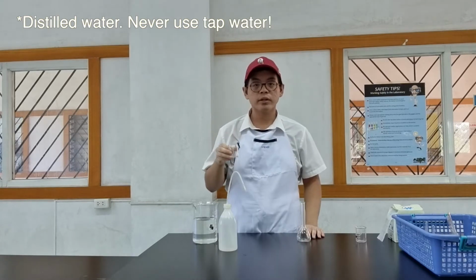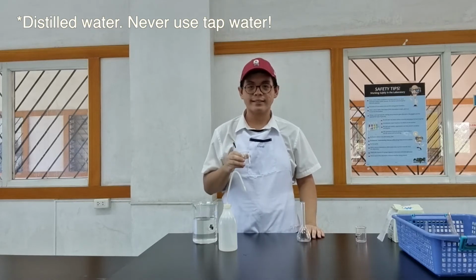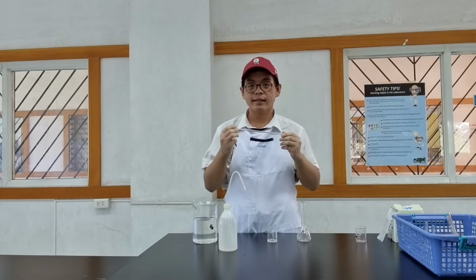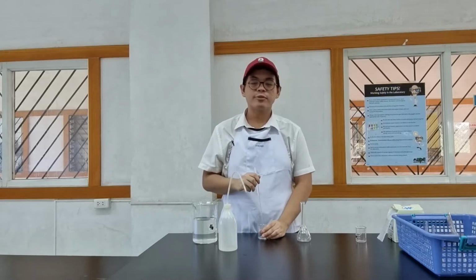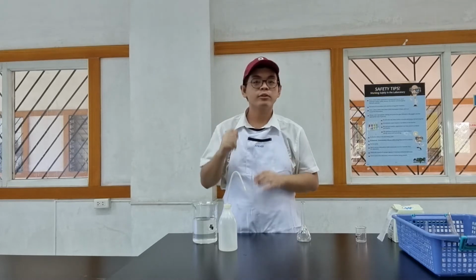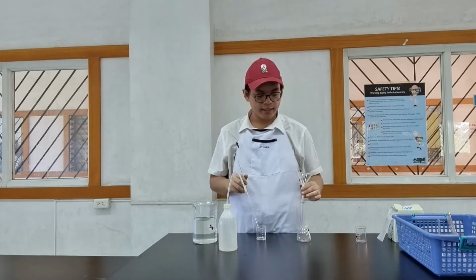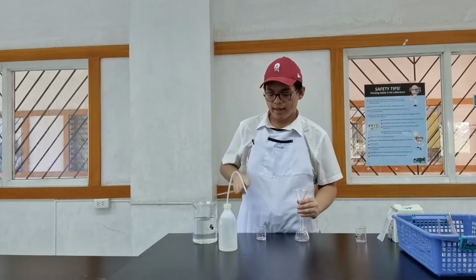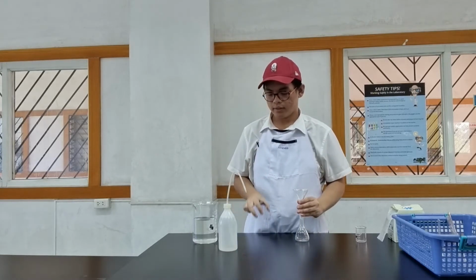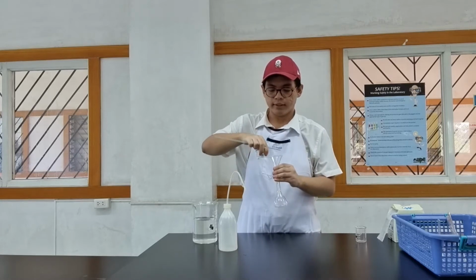It's much smarter to dissolve the solid before you even transfer it to the volumetric flask. I have here a clean glass rod, and I am just mixing the solid to make sure that it's fully dissolved. The next step is to transfer the liquid into the volumetric flask. I'm going to use a funnel. Let me place the funnel inside, be careful. And I will just directly pour it in.